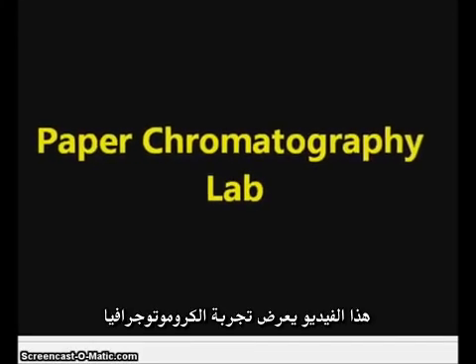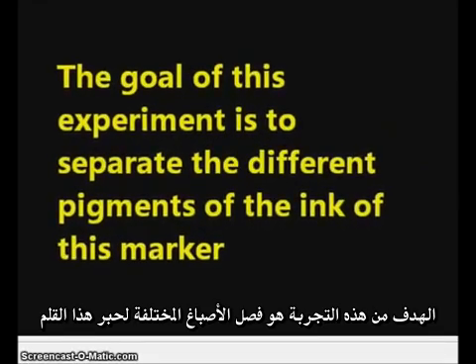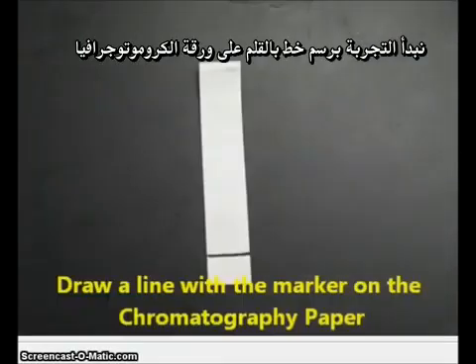This video shows an example of a chromatography experiment. The goal of the experiment is to separate the different pigments of ink which are present in a wet erase marker, which we'll see right here. A vis-a-vis marker is wet erase, which means that the pigments are water-soluble.